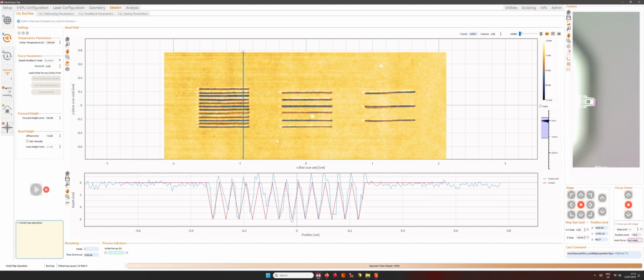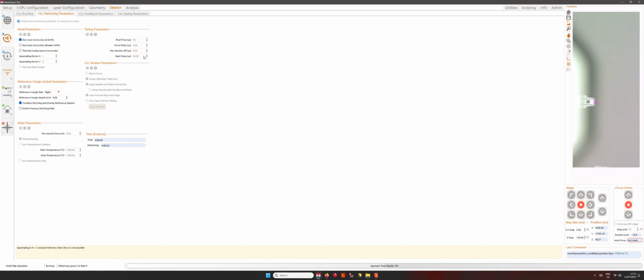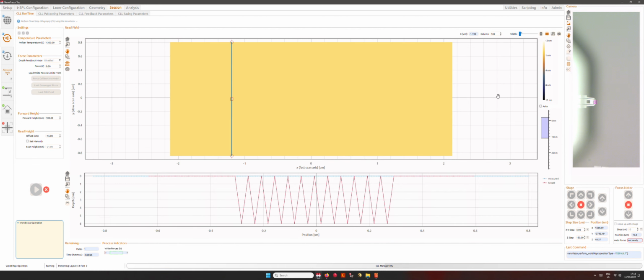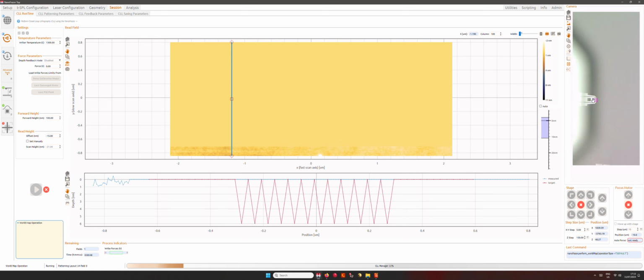In this case, the heat pulses are going to reach a higher temperature. We should be able to reach a higher temperature at the interface between the tip and the substrate. Therefore, we will probably write deeper. Here we may have merging of the features. We're also using a high resolution stack in this specific case.